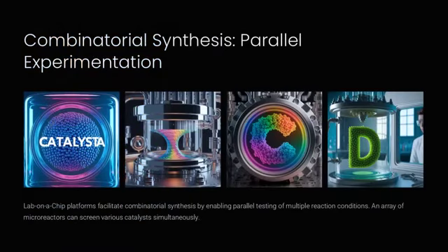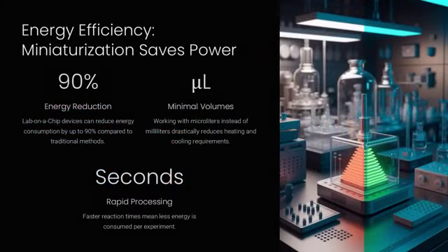Thermal gradients in microchannels induce convection by creating temperature-dependent density differences. For example, localized heating on one side of a chip generates a gentle flow that enhances mixing, much like warm air rising in a room causes a natural circulation of air currents.